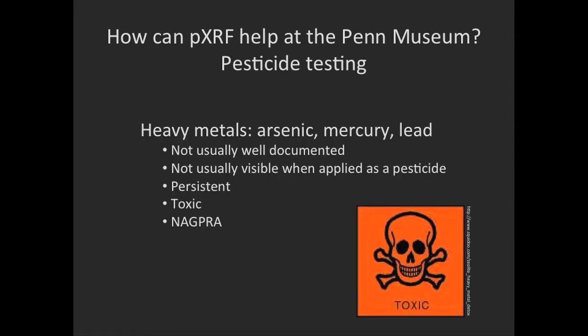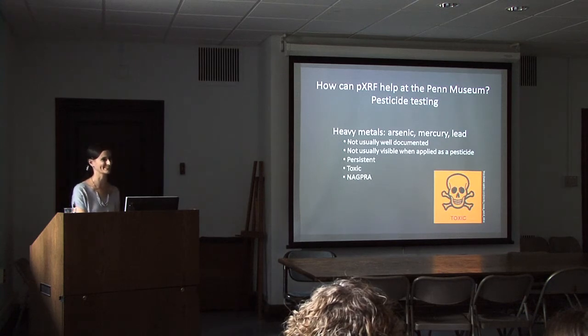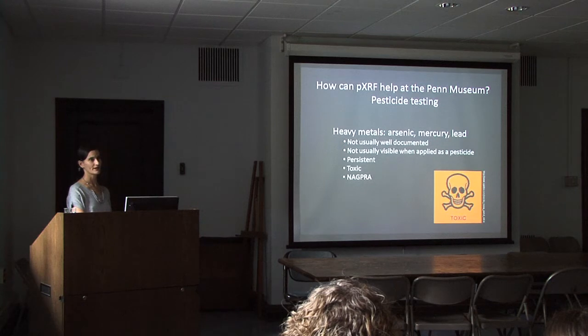For pesticides, heavy metals were commonly used until as late as the 1970s. We know that heavy metals were used as pesticides here at the museum on our collections. This is not usually very well documented, and pesticides, when they're applied in various methods, are typically not very visible unless they're applied in huge quantities, which I think we might have an example of that here. I'm sure we do. But since it's not well documented and not visible, we don't know what artifacts were treated with pesticides and what wasn't.